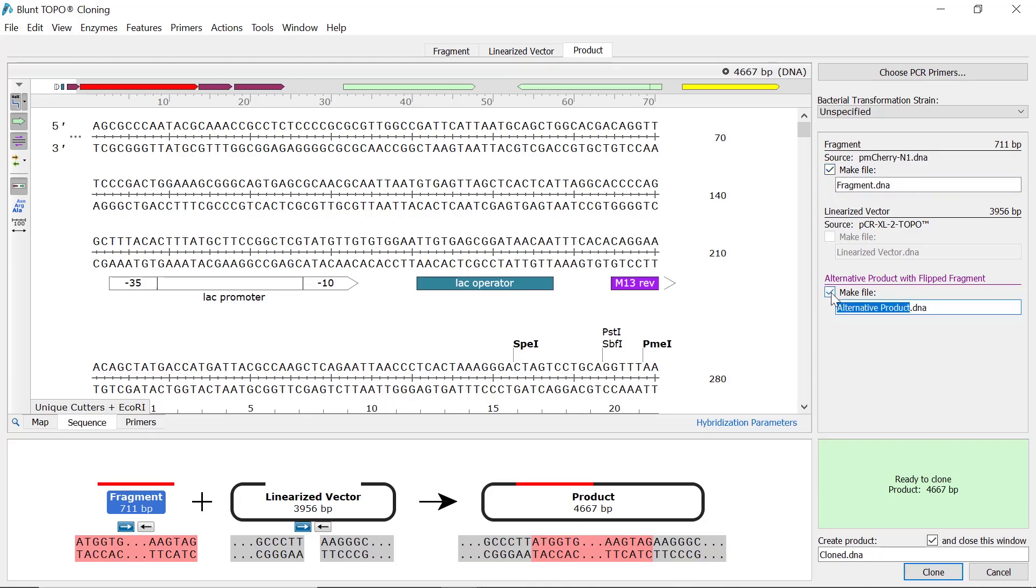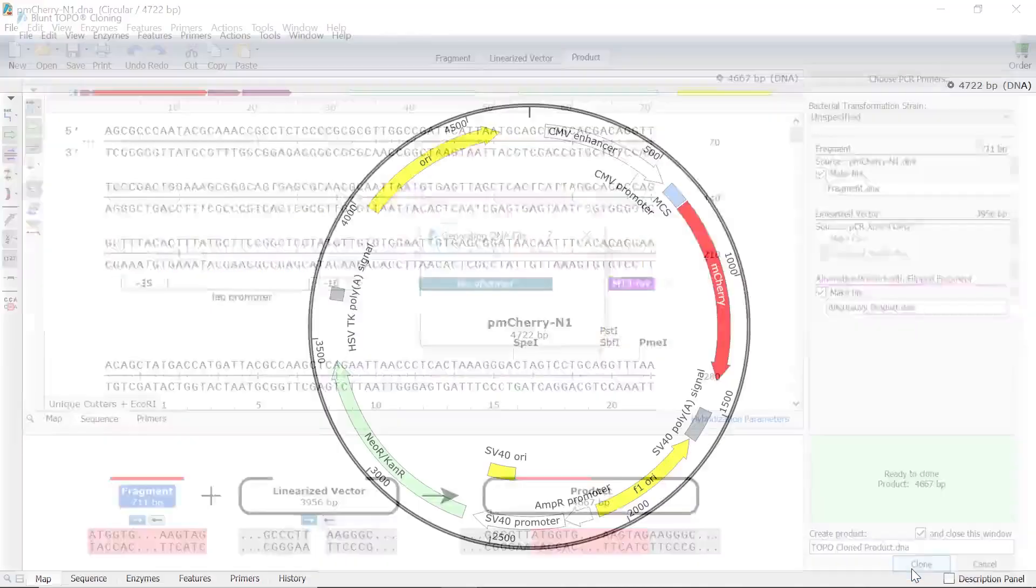Since TA and blunt topo cloning are non-directional, Snapgene will create two products: one that contains the fragment in the forward orientation, and another with the fragment reversed. Finally, rename the product file containing the unflipped fragment at the bottom, and press clone to simulate the cloning process.